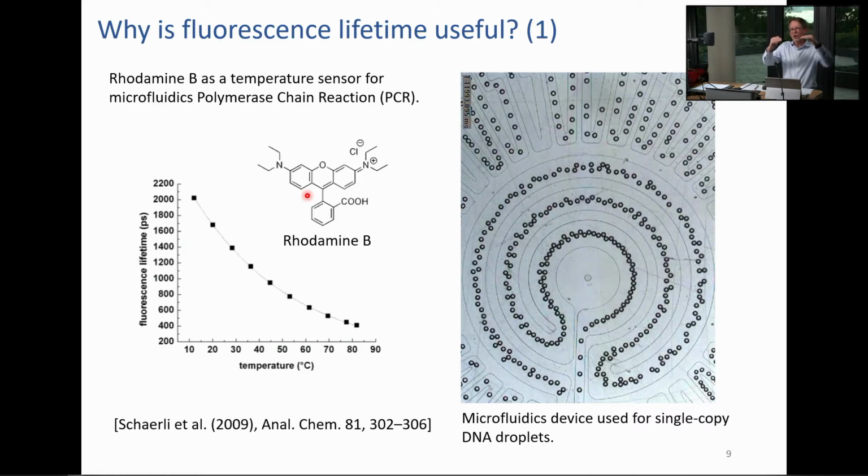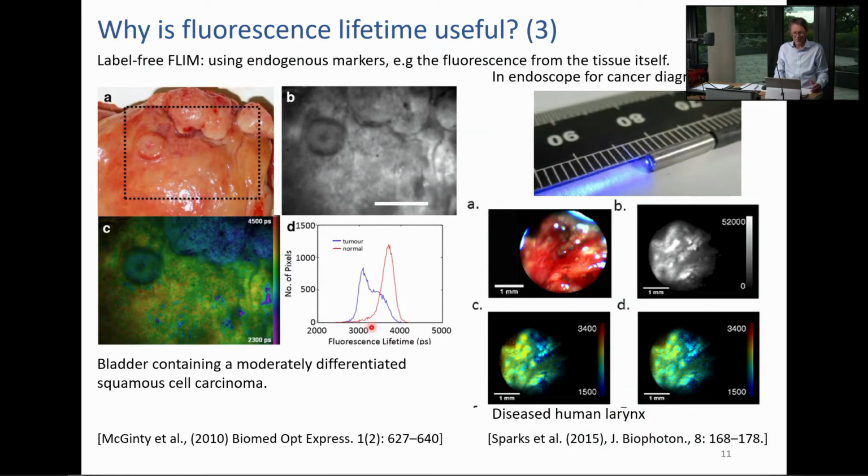So the Q in the 1/(A + Q) term is highly temperature dependent, and you can see how the fluorescence lifetime of rhodamine changes as you increase the temperature. So it decreases as a result of temperature. So by just measuring the lifetime inside these droplets, you can get a temperature readout. It's very useful. And you can do this in the microscope.